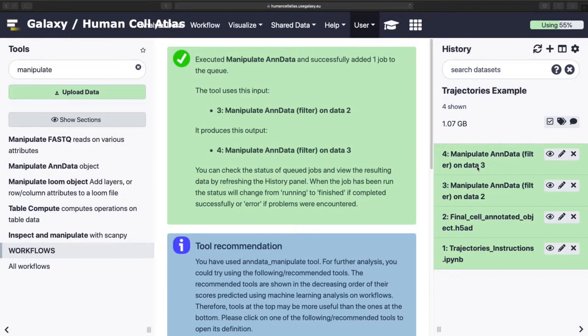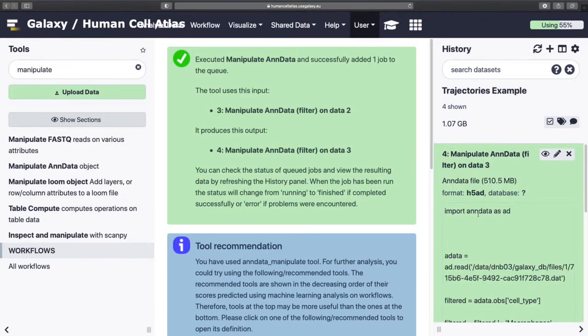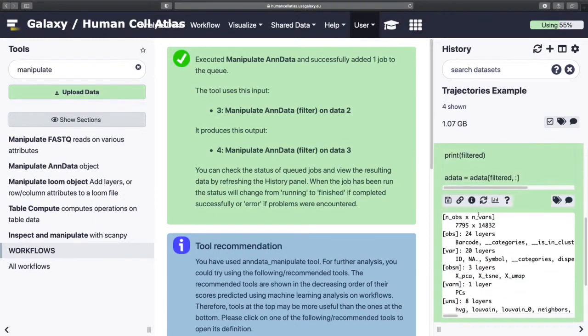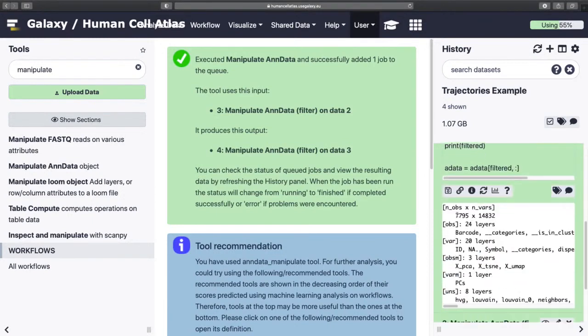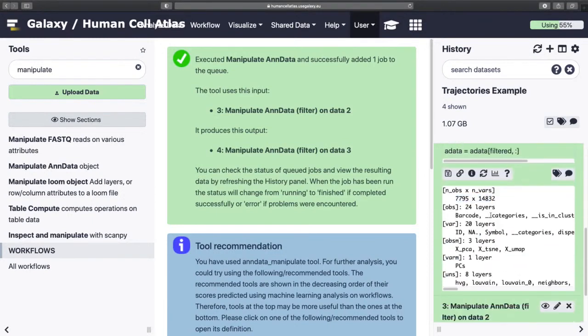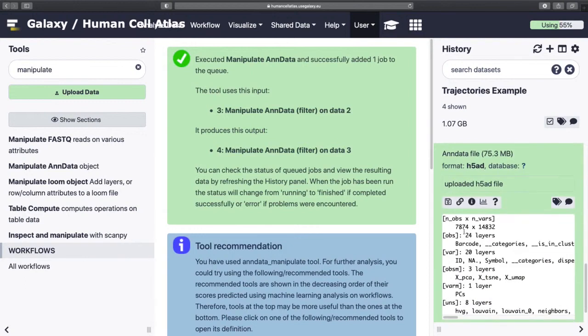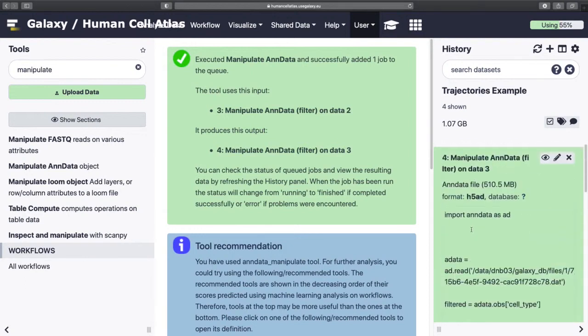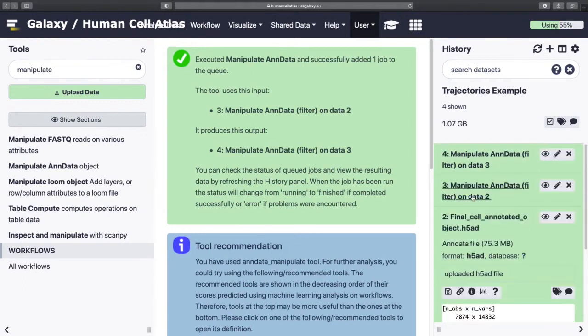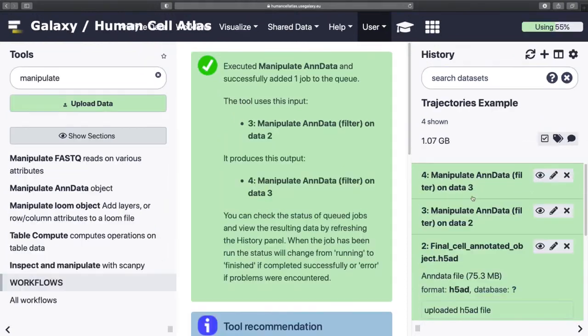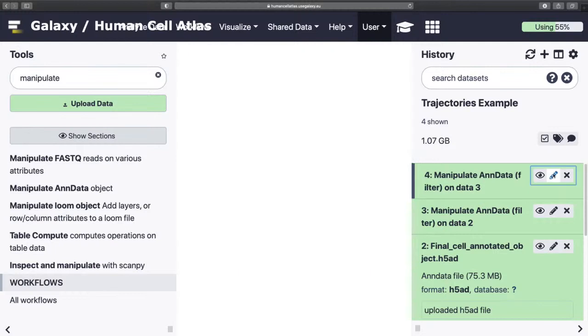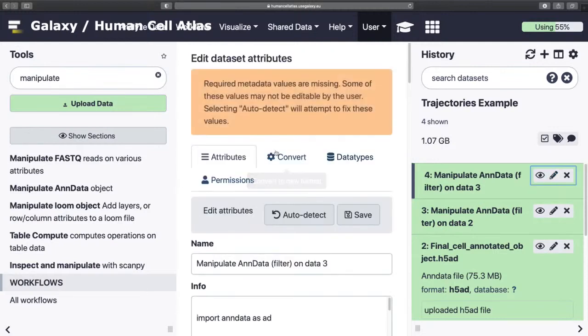And we're done. And we can then look within these objects and see, hopefully, the number has changed. Yes, it has. Zoom back in. And I'm going to rename our output.